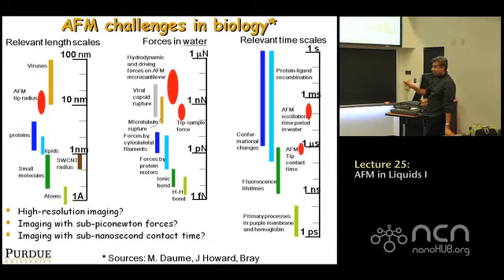It would be nice to take subsequent images, see a protein standing like this, then change something and see it gradually morphing and changing, but those kinds of things are hard to do with normal AFM unless you have a special way to slow down that process. Conformational changes are much faster than AFM time scales typically. So you're typically able to observe relatively slow processes as they occur.